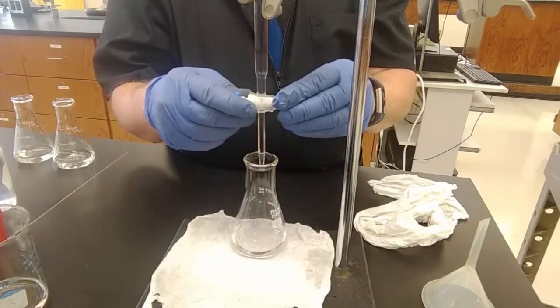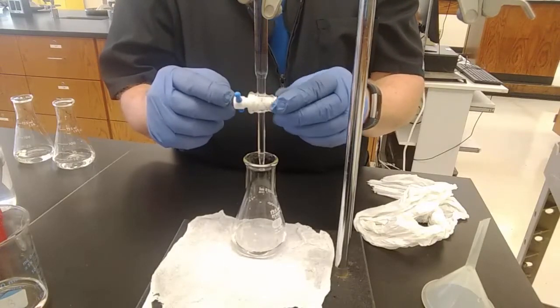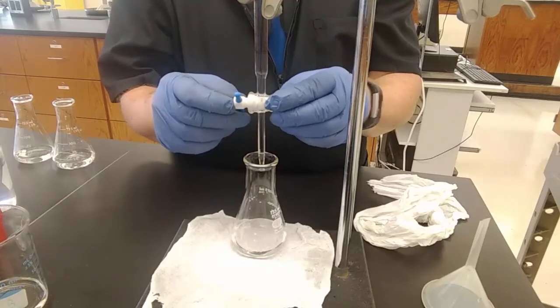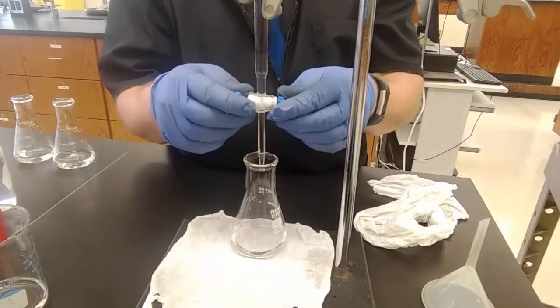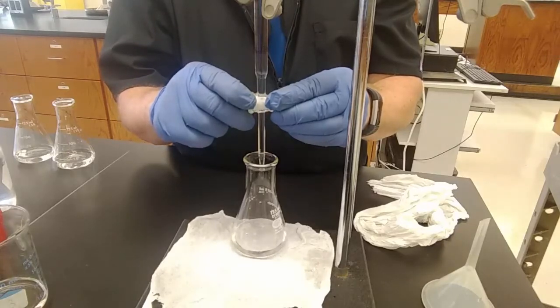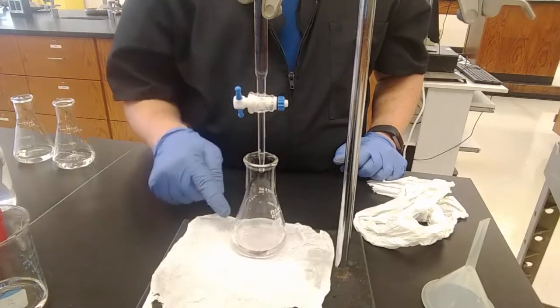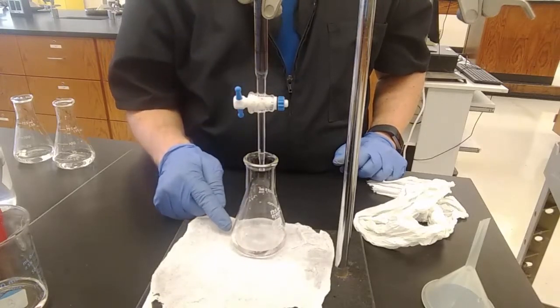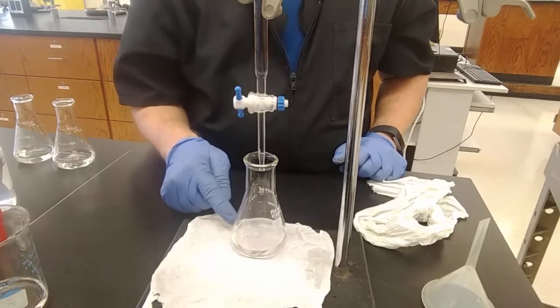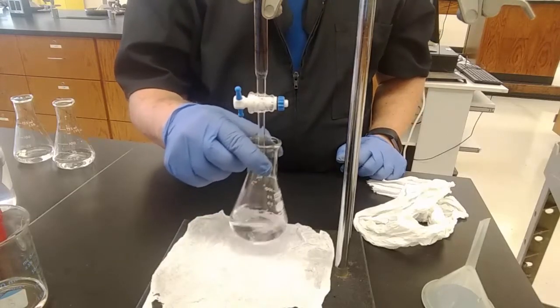Now, I am paranoid just from back in the day when these things used to not be made out of silicone. They were made out of glass, and occasionally they would pop off, and then everything would go all over the table. It's annoying. So I like to hang on to both sides at once, but this doesn't give you a hand to stir with, so I can get it going. You might be able to see right as it hits, it turns pink, because locally, all the acid and base have reacted, but not globally.